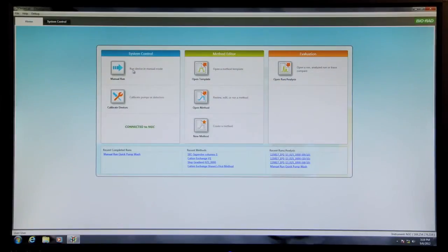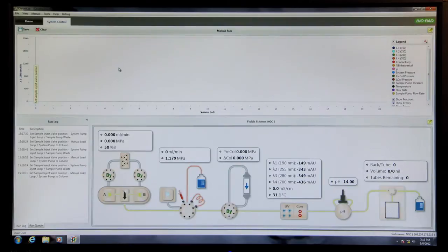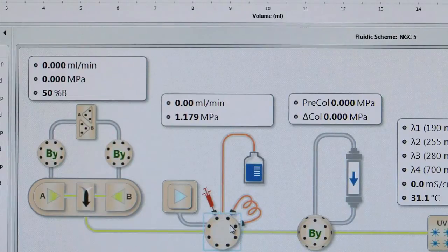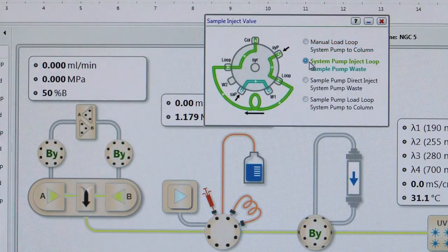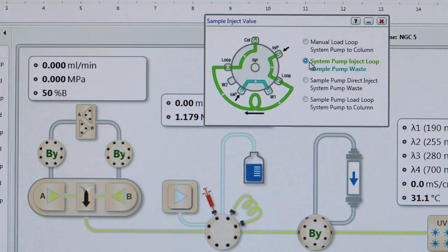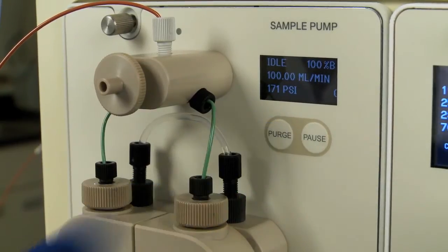Launch ChromeLab software and select Manual Run in the home screen. Double-click the Inject Valve icon. On the Inject Valve faceplate, select System Pump Inject Loop. Then, press the purge button on the sample pump faceplate.